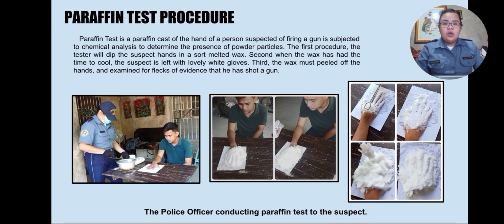So, second, when the wax has had the time to cool, the suspect is left with lovely white gloves. So, third, the wax must be peeled off the hands and examined for flecks of evidence that he has shot a gun. So, dito naman po sa last part na picture, yung wala ng kamay, yun na po yung i-examine sa laboratory para malaman kung siya ba ay nagpaputok ng baril.